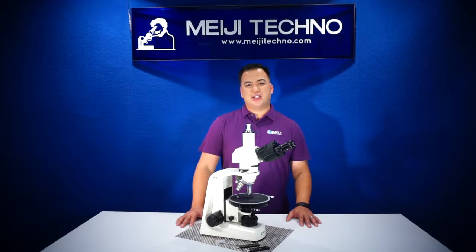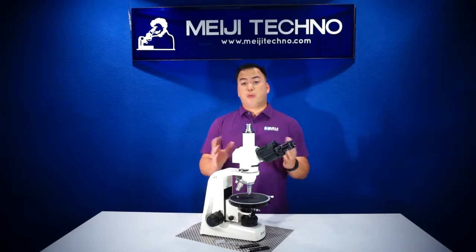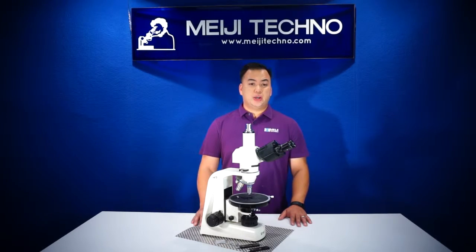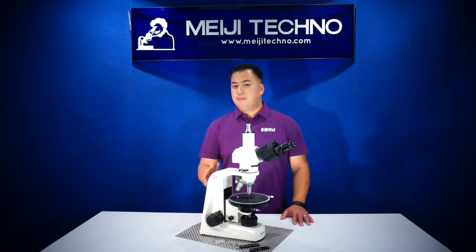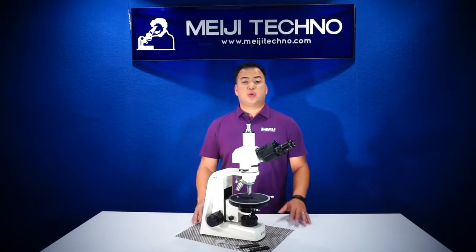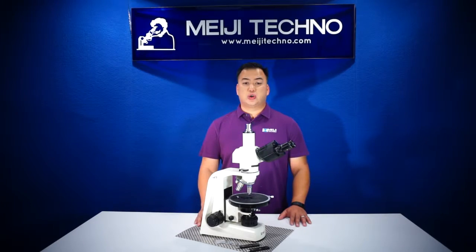The MT-9000 series is a suitable instrument for most applications such as geology, petrology, mineralogy, forensics, material science, manufacturing, crystallography, medical research, environmental science, and industrial quality control and quality assurance applications.